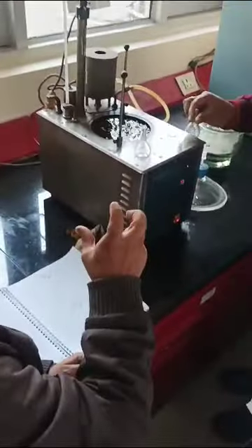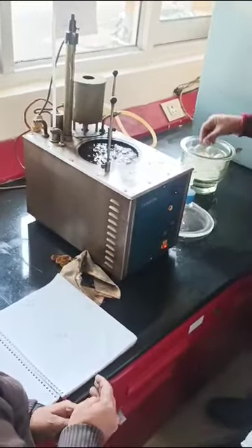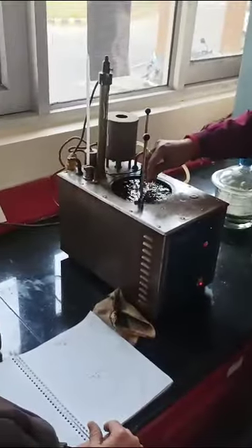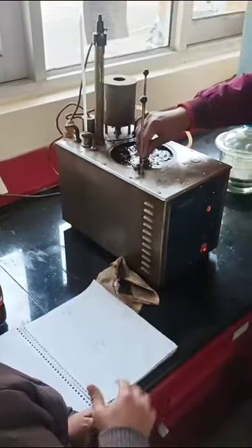So let it complete. Then after that, if we find some time after the calculation, we will do the smoke point. Smoke point is very important in ATF, aviation turbine fuel. See, smoke point is an index which can tell you the presence of aromaticity. If there is lots of smoke, then definitely you come to know my fuel is high in aromatics. If smoke is low, then it is not free from but low in aromatics.